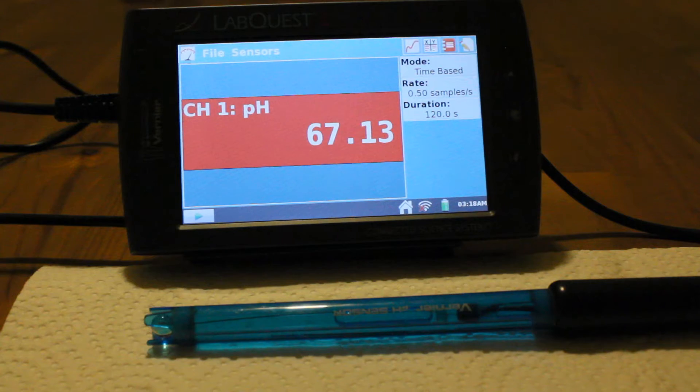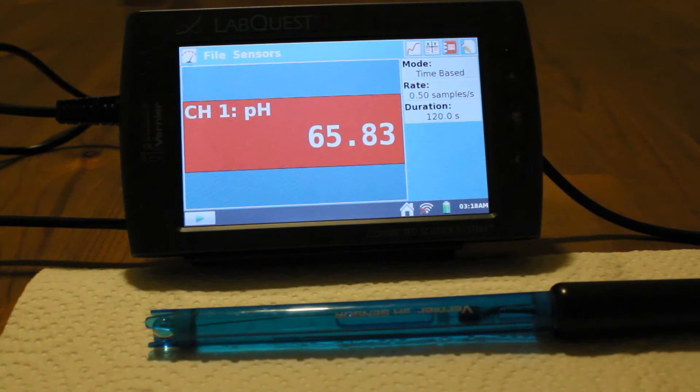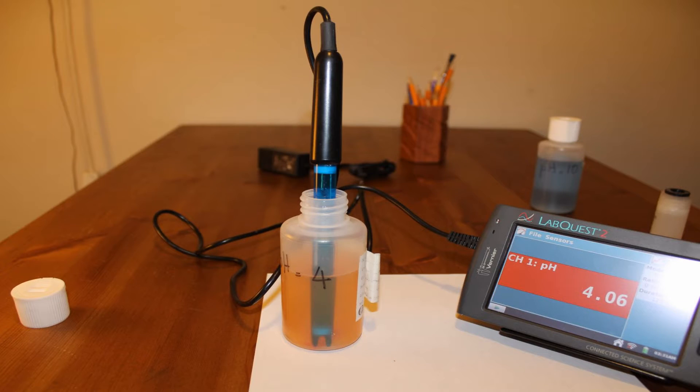Remove the pH meter from the storage solution by gently unscrewing the bottle, pull out the pH meter, and immerse it in the buffer solution of pH 4.